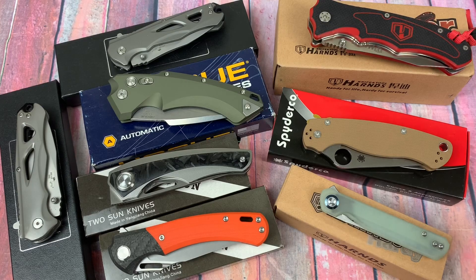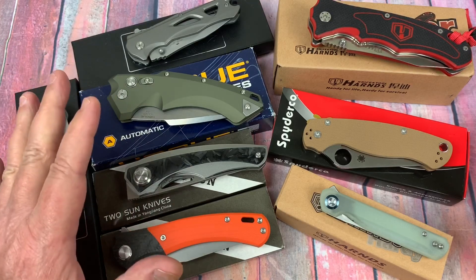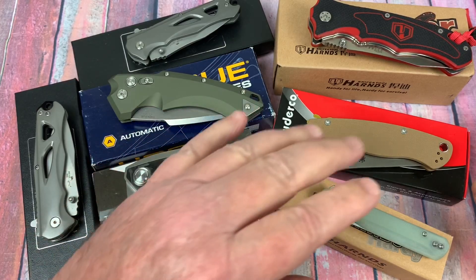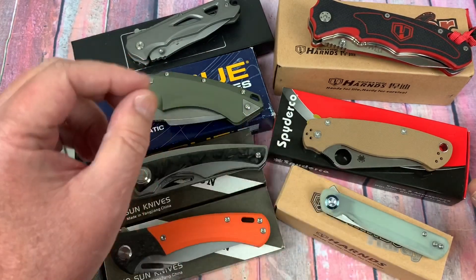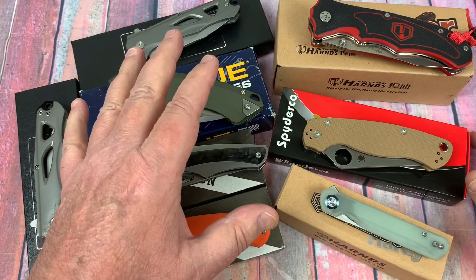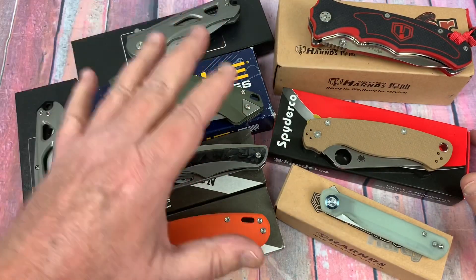Welcome to Love Them Knives Channel, LTK here. We have a batch of knives, just want to report on these. I did a report before on some of these knives, and the Rockwell numbers looked somewhat high on some of them. I had them double checked, and I'm going to redo this. I took that video out and I'm redoing it now with more conservative Rockwell numbers.